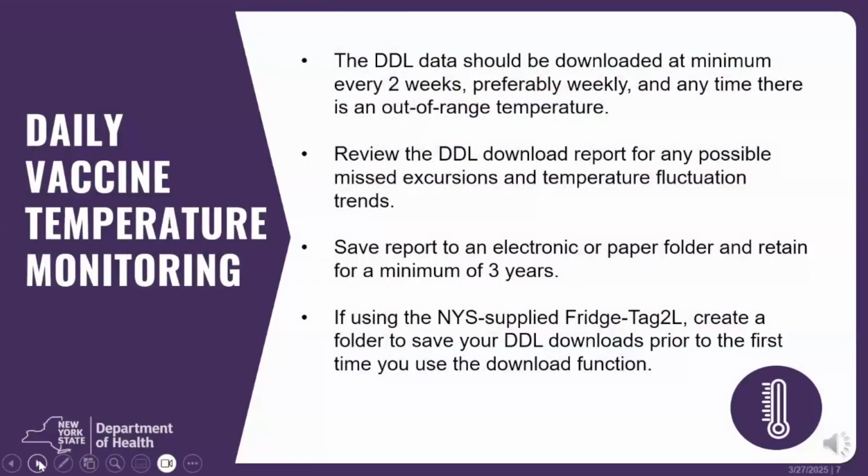It is required that DDL data be downloaded at a minimum every 2 weeks, preferably weekly, and anytime that there is an out-of-range temperature on your digital data logger. Review the DDL download report for any possible missed excursions and temperature fluctuation trends.